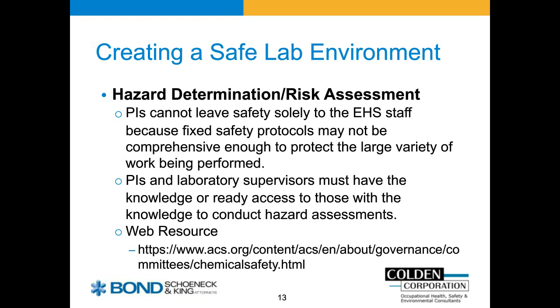In the research lab, there's a couple of heavy hitters besides HF that you'd want special controls for, maybe perchloric acid, where you'd need special kinds of hoods and washdown systems. Anything that would trigger an OSHA expanded standard. Methylene chloride, you've got to do special training for that, some of the other carcinogens. I would say probably the focus on the OSHA expanded standards would be the ones that would trigger those special reviews. But also want to make sure we're not forgetting the undergraduate teaching labs, making sure we're having a look at those syllabi and making sure nothing serious is going on there.